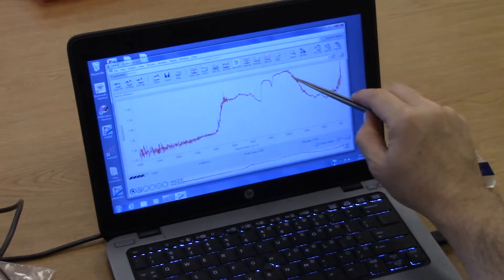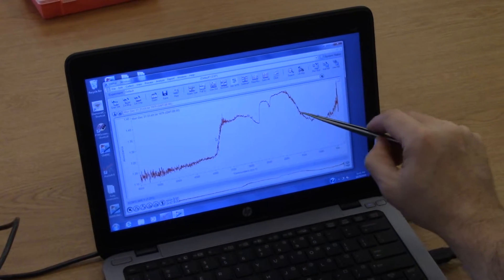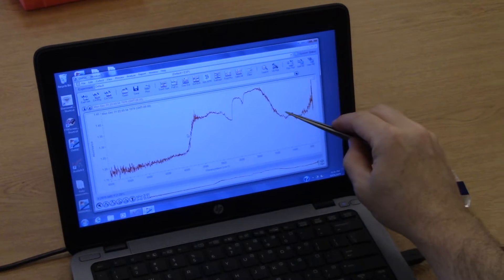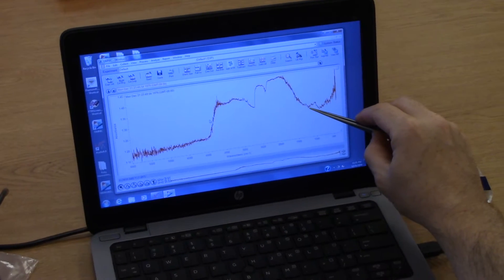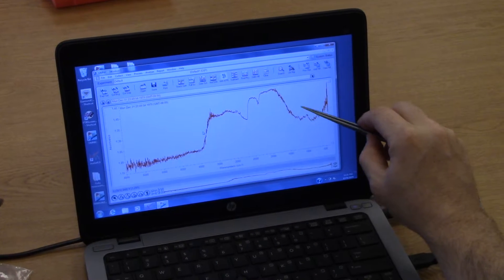This immediately, unquestionably tells you it's a diamond. This absorption, that absorption, that absorption are inherent in all diamonds no matter what. Now over here is where nitrogen absorption happens, and 98% of natural diamonds have absorptions over here, either weak to strong. His has none.